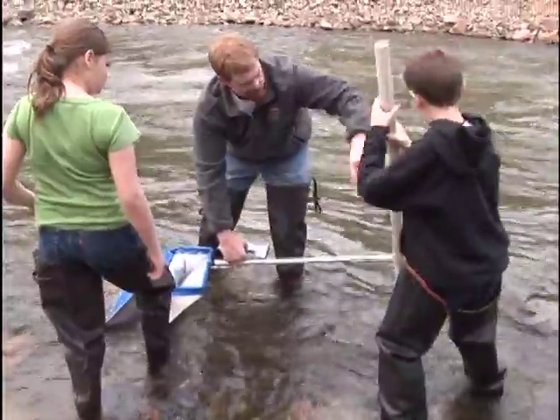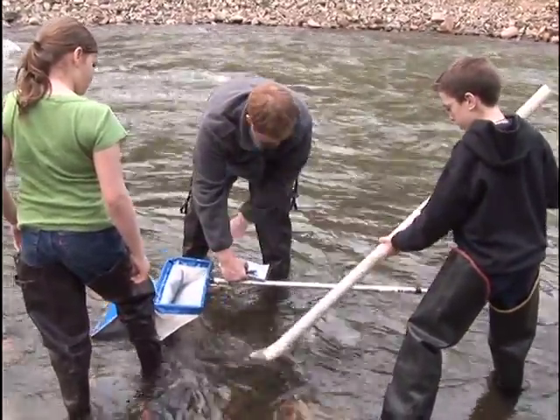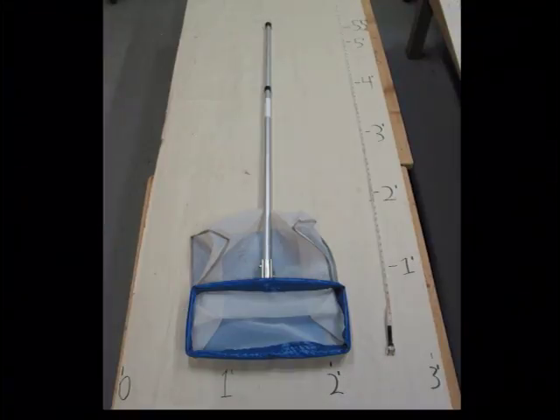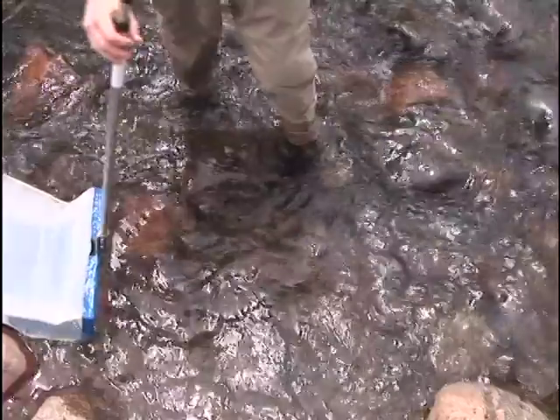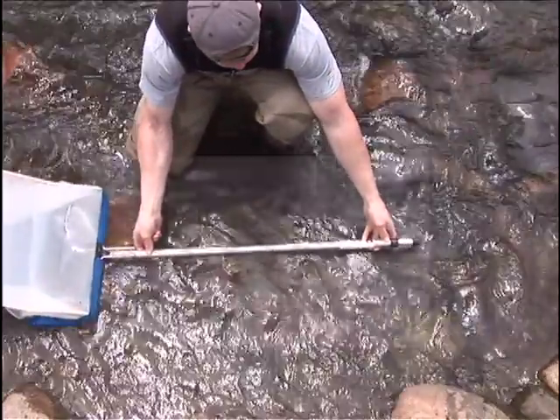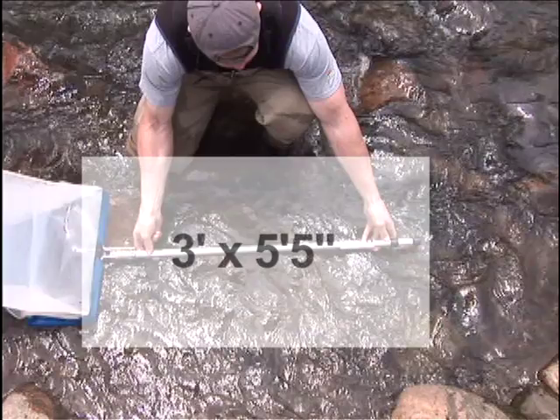Move to the most downstream riffle for your first kick. Your kick area will be a 3 foot wide by 5 foot 5 inches long rectangle. Measure your net prior to sampling and mark a length of 5 foot 5 inches on your net handle to remind you of the proper length. Measure the kick area at the riffle you will sample by laying the net down and making a mental map of this sample area. Inside this rectangle will be the area you will kick.